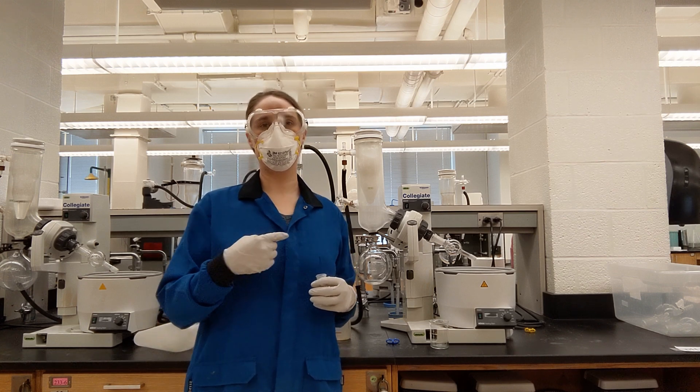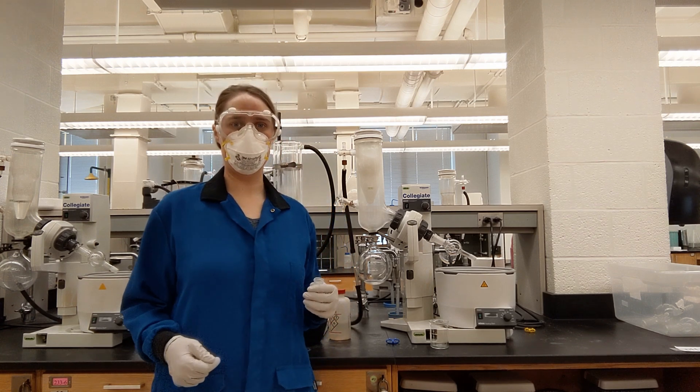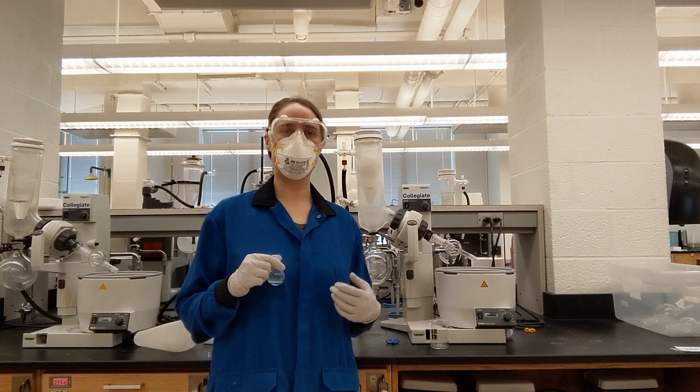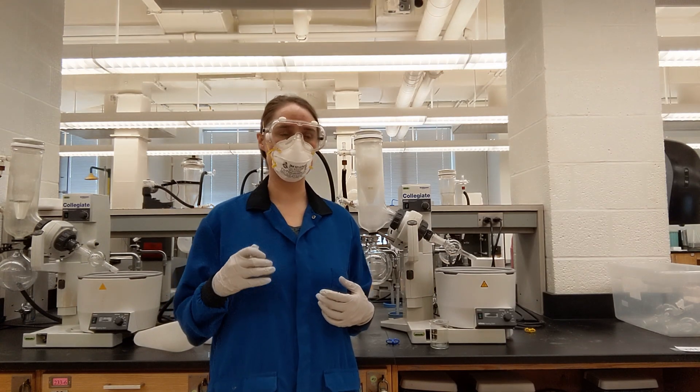This is how to use a rotavap, also known as a rotary evaporator. This is a device you would use if you want to boil off a liquid very quickly. It's usually used for organic solvents.